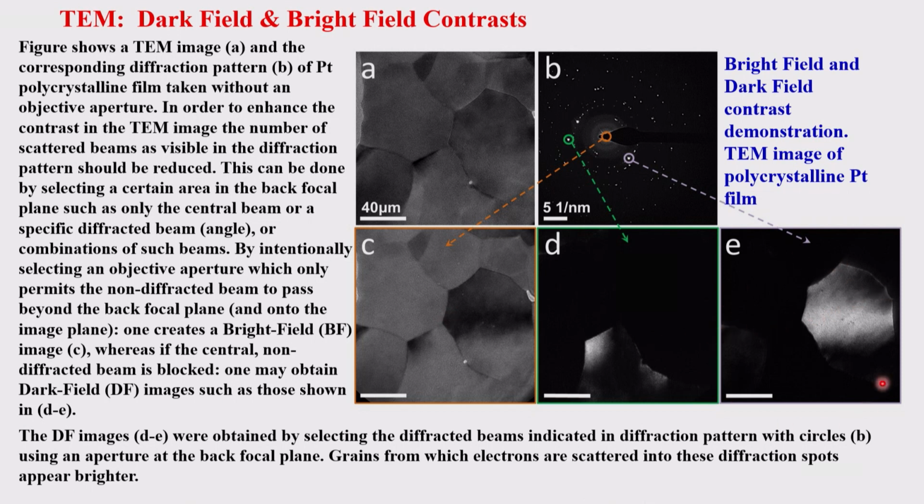So the rest is all dark and your object becomes gray, and the rest is all gray and your object becomes dark. So that is what the dark field, bright field is. At times people do both and try to map your structural features, topographic features, etc. So DF, these are all there.